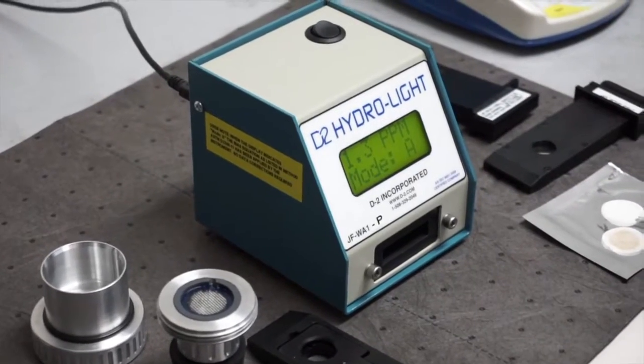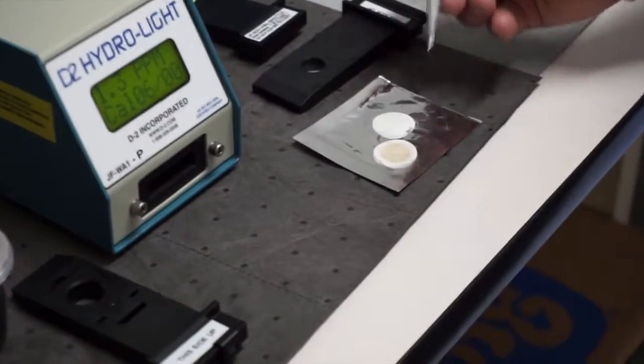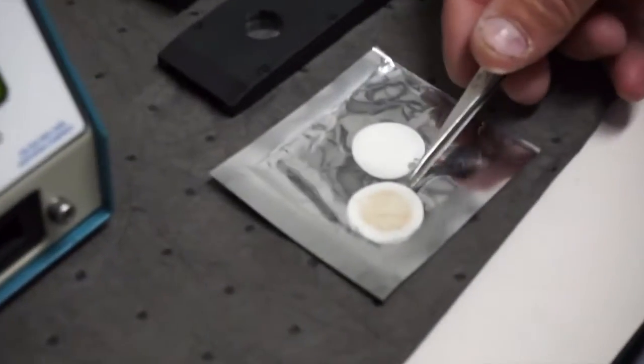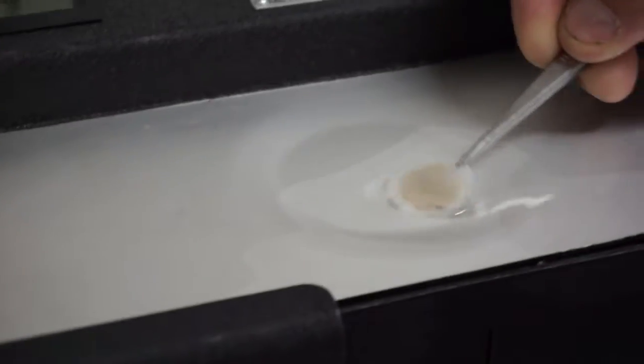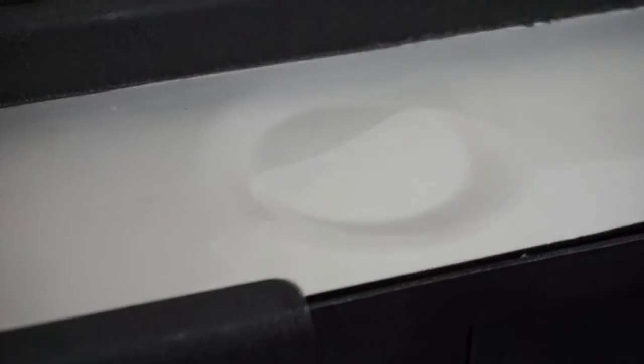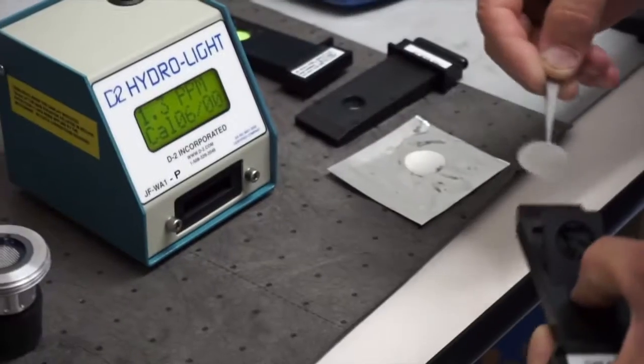The other question we get asked a lot about is the two pads. You can see they've dried out, but in the original method, the Navy tells you that if you have a dried out pad, you can simply soak it in fuel and then put it back in and redo the measurement.